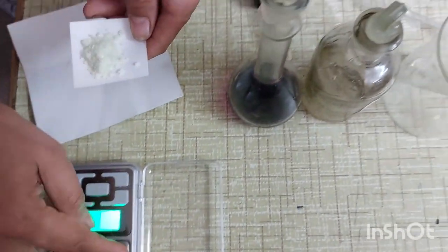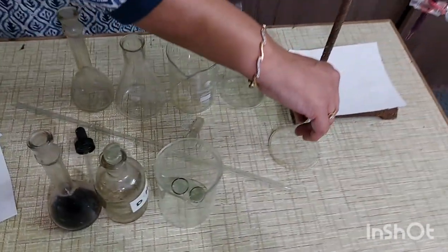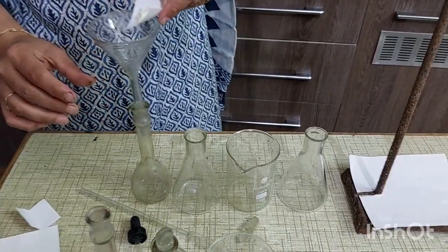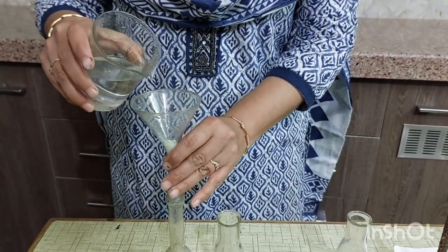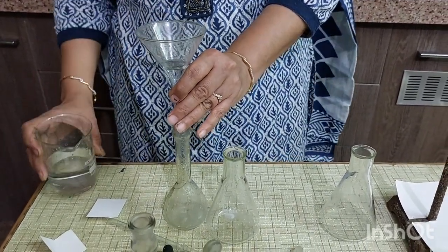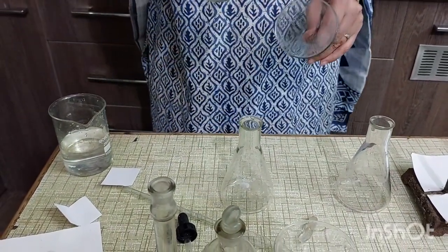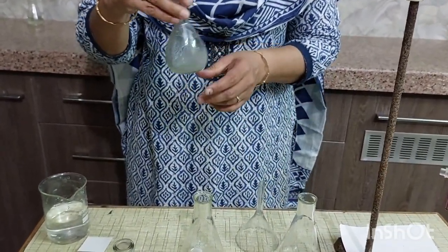Now this salt is transferred into a clean 100 ml measuring flask. Pour a little amount of water from all sides of the funnel. Dissolve this 1.30 gram of Mohr salt properly.